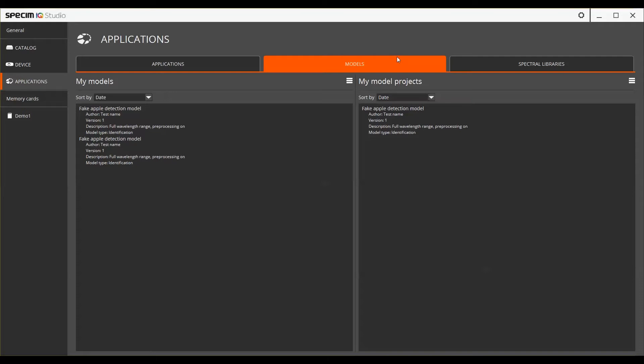In the models tab, you have both the model projects and ready saved models. The my models list presents the ready models which are ready to be used in applications.